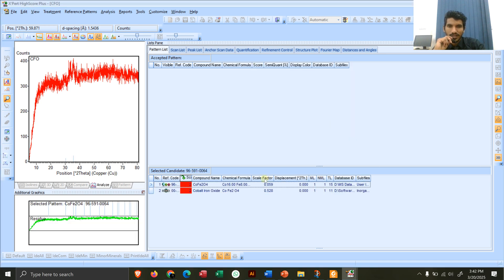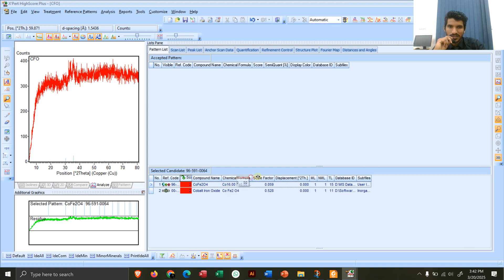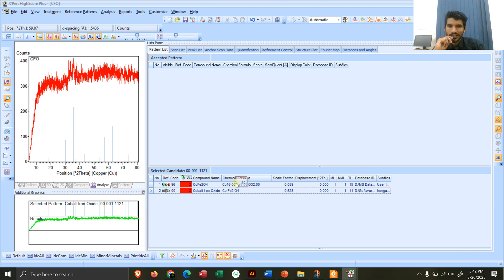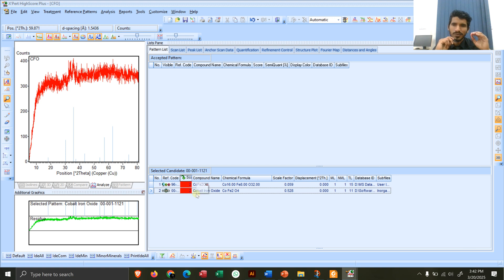After the search, you can see two compounds have appeared that somewhat match our pattern. Clicking on them, we can see the score is only about two percent matching — so the matching is very low. This means cobalt ferrite has been found, but in very minute quantity.